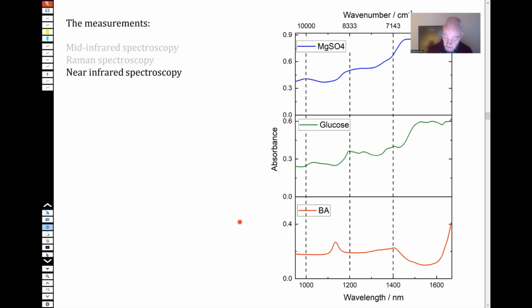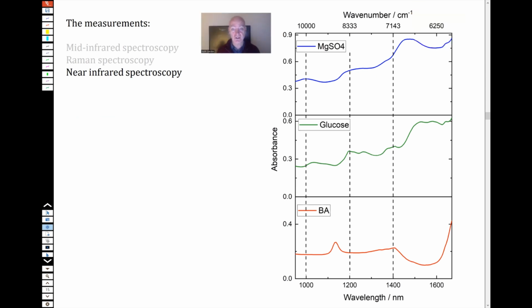So this just shows what the spectra look like. Now, first, these spectra don't look great, right? They're pretty nondescript, I think is how you would reasonably describe them. I mean, they look okay, but they look a bit nondescript. Basically, it's like a bunch of hills. There's a hill there, a hill there, a hill there, and a hill there.